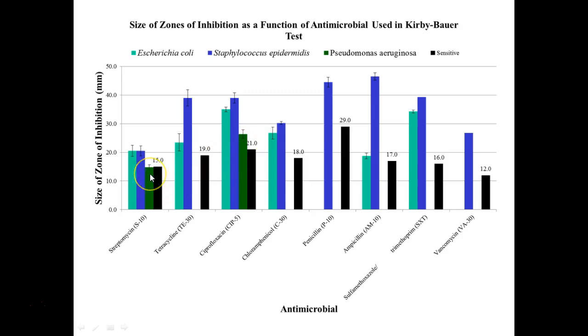It was just under for streptomycin in that run. All the rest, we didn't even have measurable zones. They were 0. That's why you have a blank space here. Blank, blank, blank. It just laughed at it, right? And then for E. coli, again, we see that 0 here, right? E. coli would be right here for penicillin. There's no bar at all because it's 100% resistant.